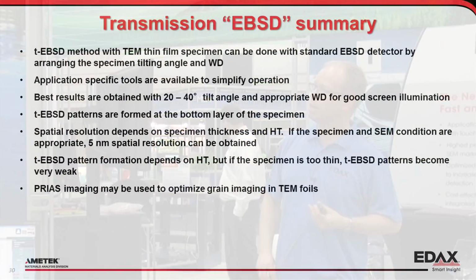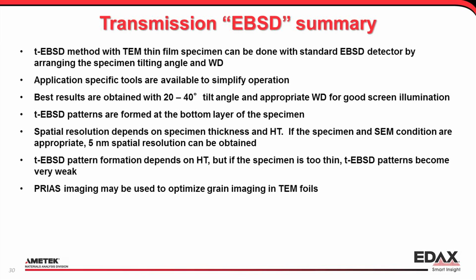About 5 nanometer is definitely doable. The pattern formation depends on the high tension, specimen thickness, and eventually the beam spread. And then finally you can use some of the other imaging tools and normal EBSD as well to prepare your sample before going to the TEM.